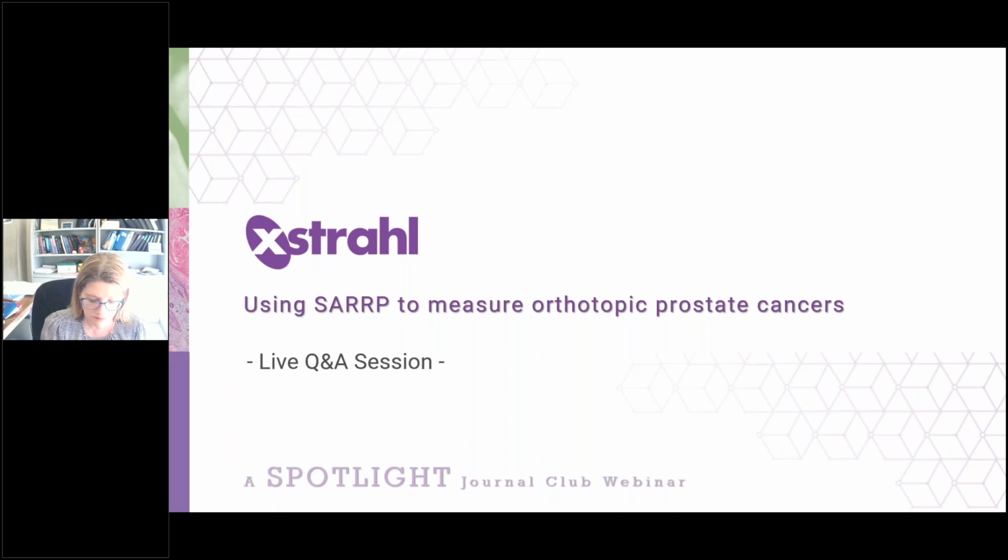And then I think we have time for one more question. Can you detect lymph nodes or metastasis? I don't think that you can detect either one very reliably. Maybe if you have a really enlarged lymph node, you might be able to see that, but I think that's going to be really difficult to discern on the CT imager. And metastases, I don't think you'll be able to, unless the mets are large. If you were to open the animal up and you could actually see it, I think you could see that on CT, but you're not going to see micromets like you can on the IVIS.